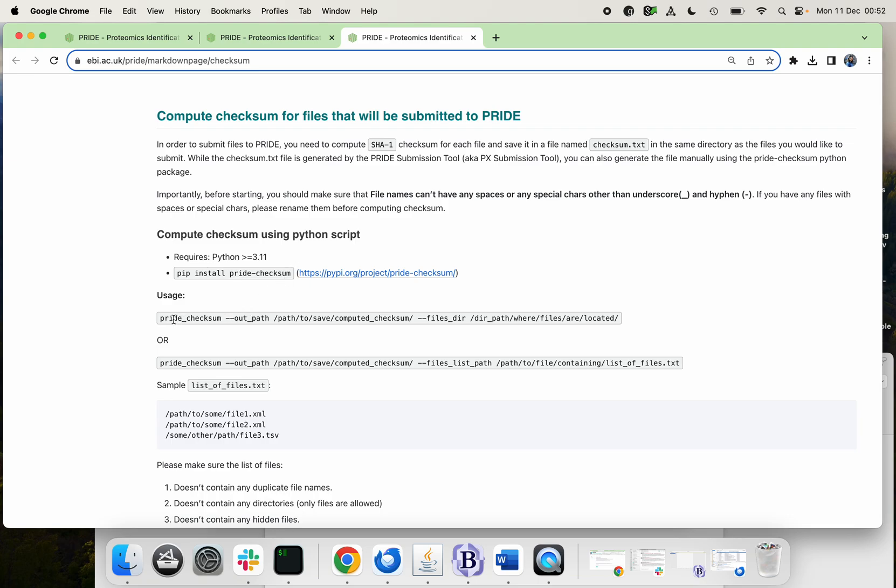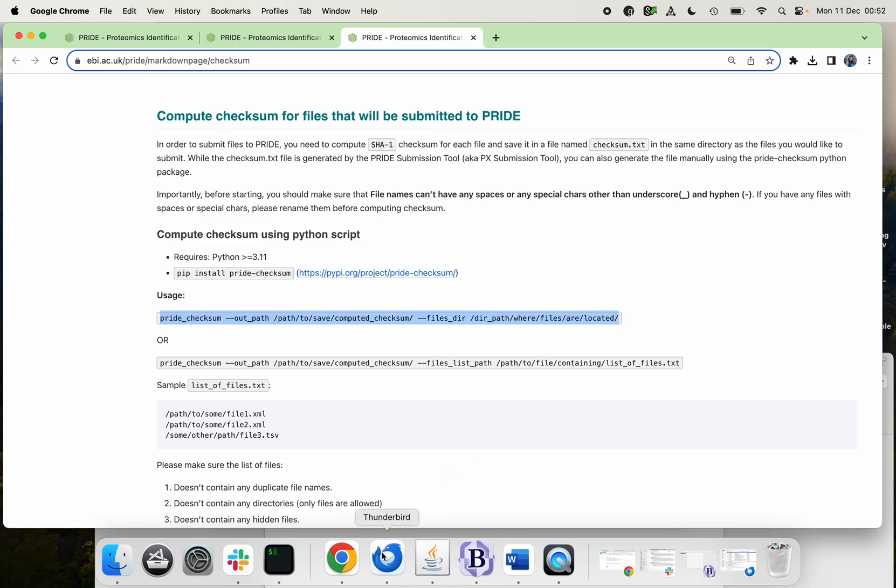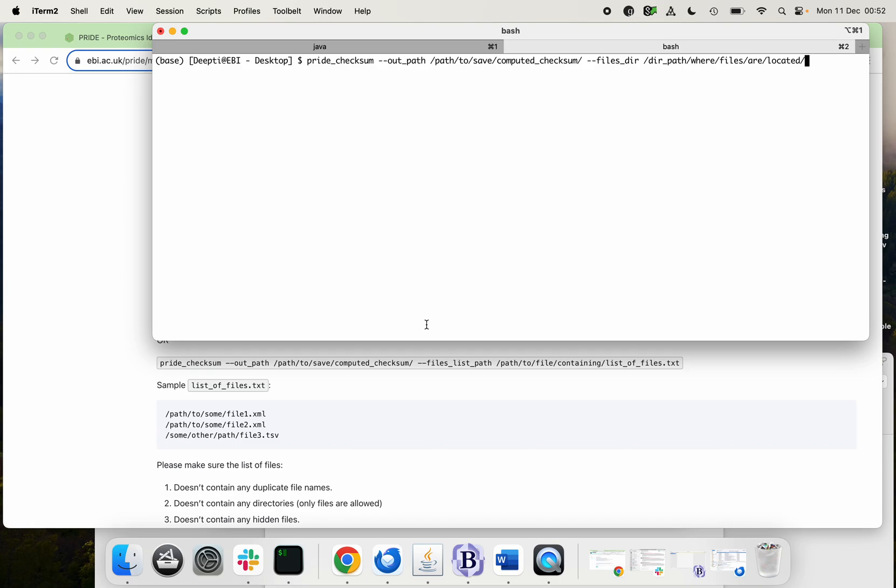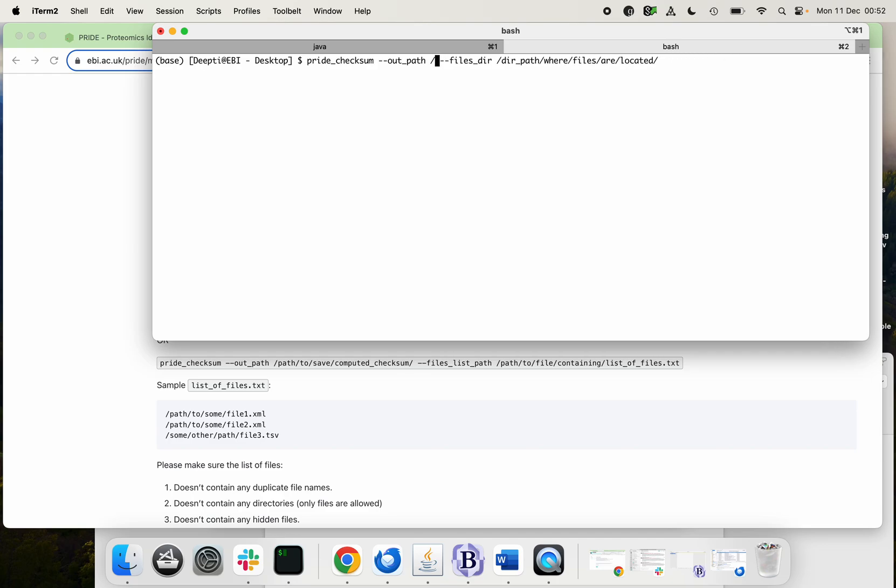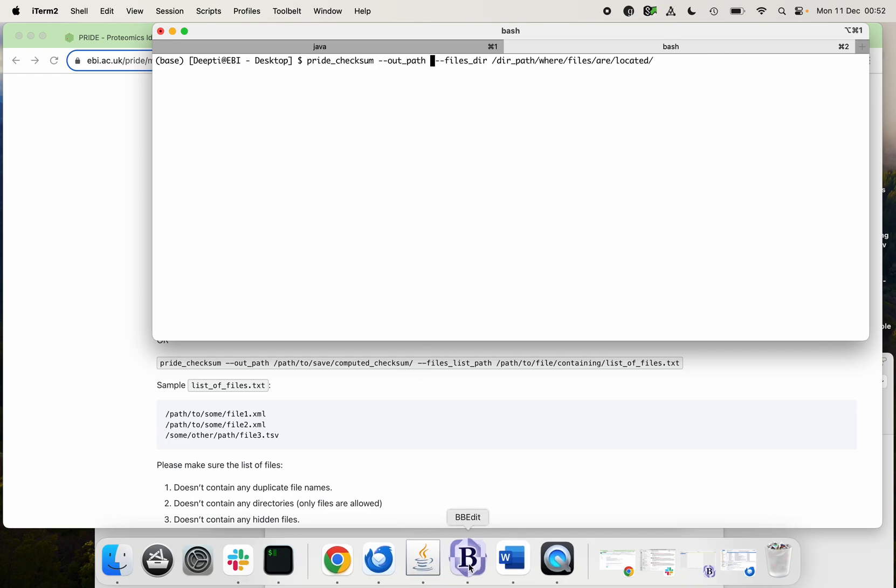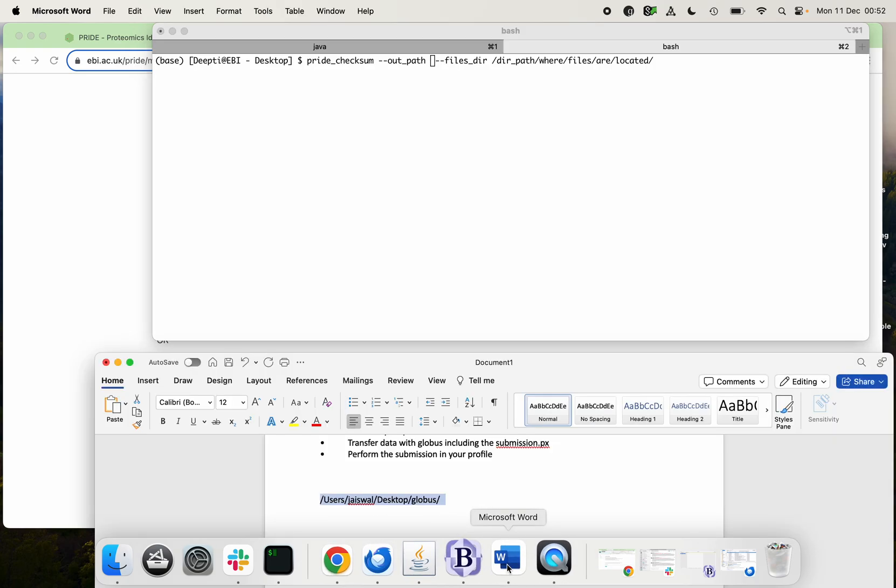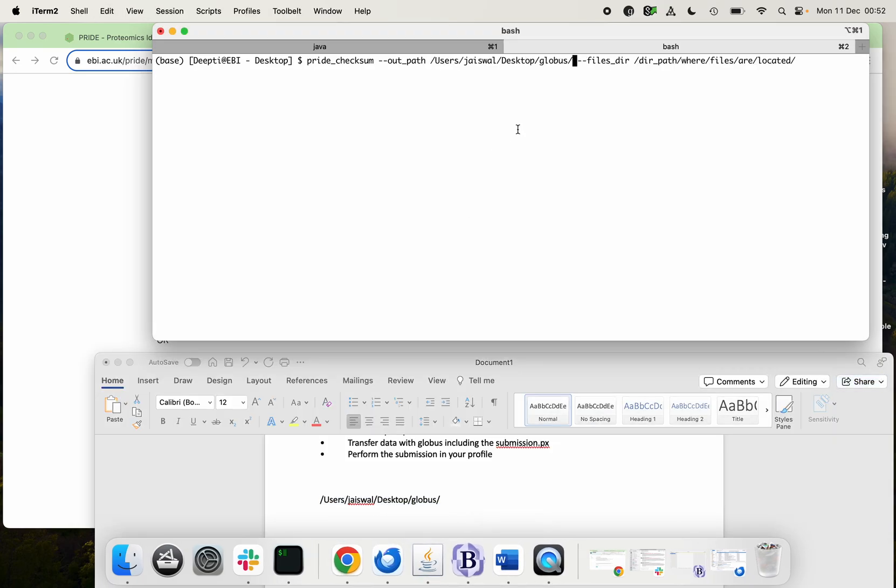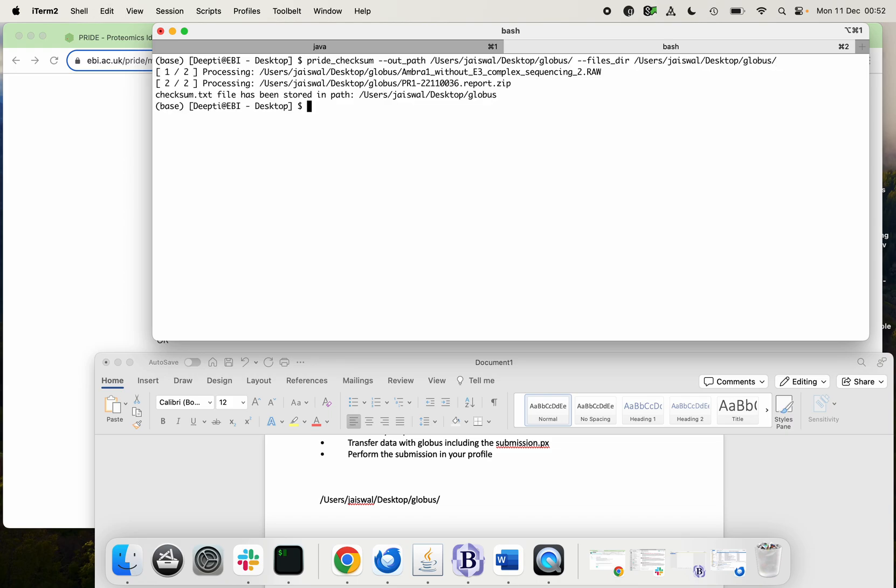After installing the Python package, you just need to enter this command into your command line. The change out path is where you want to keep your checksum text file, and I'm going to give the same path where I have kept my other files. Then the file directory is the location of all your files. So again, it's the same place. After entering, now it says that my checksum file has been stored in the path, so it has been generated.